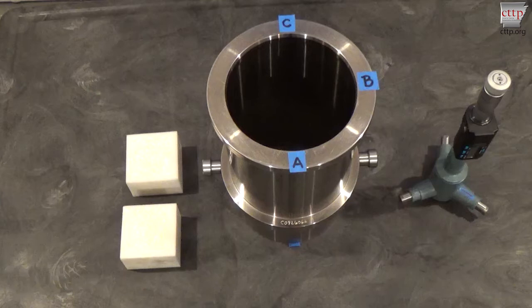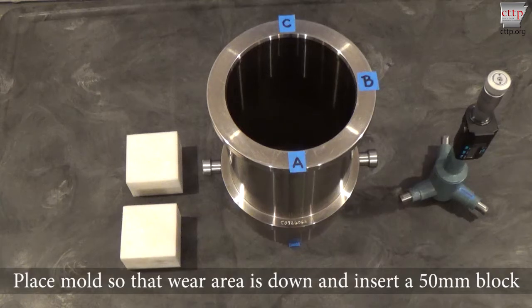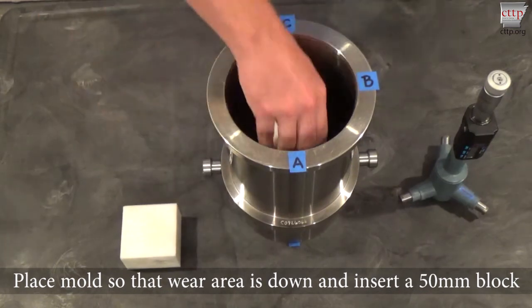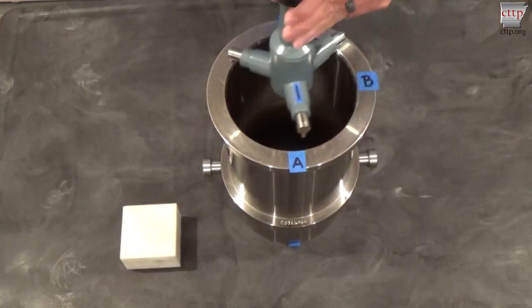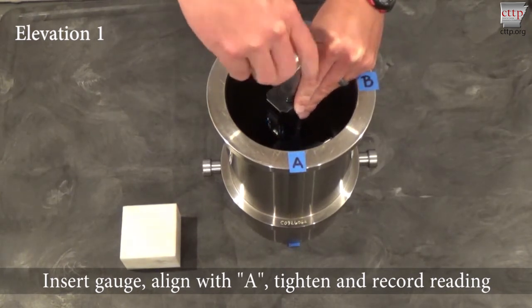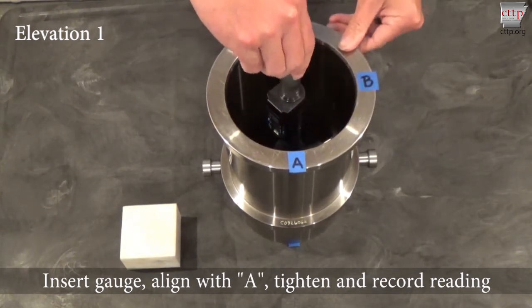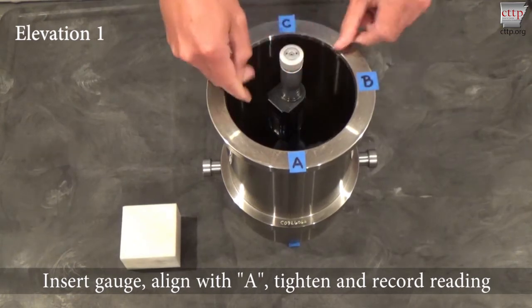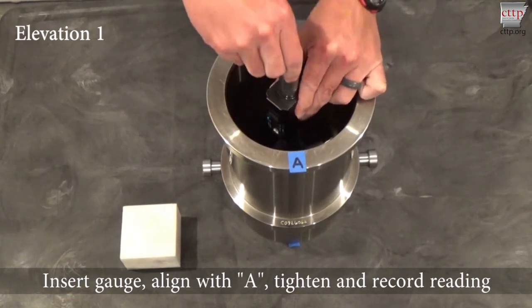Place the mold so that the wear area is down. Insert a 50mm spacer block to obtain readings for elevation 1. Insert the bore gauge until it rests on the spacer block. Align one of the three arms with A and tighten the bore gauge. Record the reading and then loosen the bore gauge.